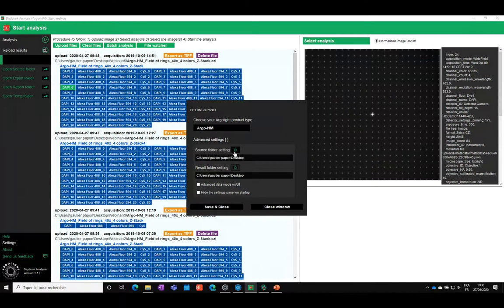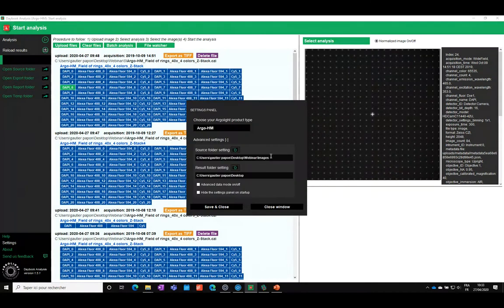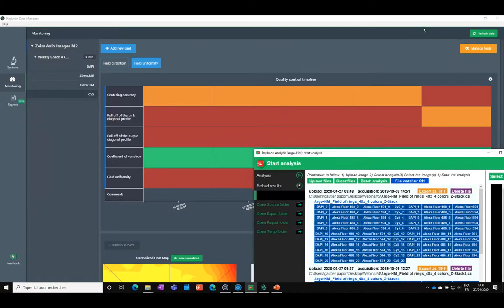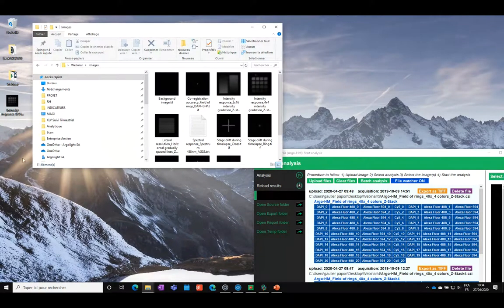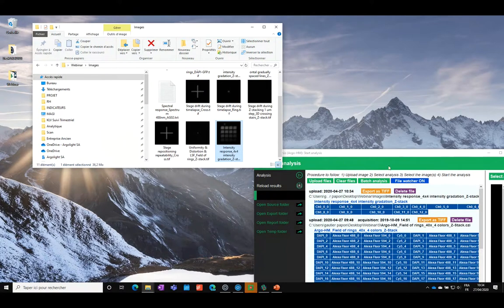So this was my desktop. I will change that for the webinar image folder. All right, and now I save the setting. So now if I go back to my analysis, I can switch file watcher on. And now I'm going to just move this image file from the desktop to the folder I just selected. All right, we can see that as soon as I moved the file, the software caught the file and added the file to Daybook, and now it's here on the library.